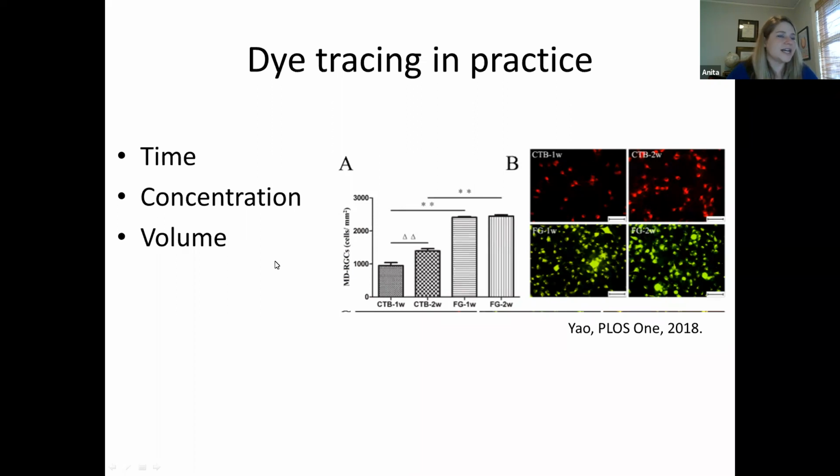And because they're dyes, the one other thing I will say is that when you're using, for example, a glass pipette to inject these dyes, you have to be really sure that you don't have precipitation of your dye at the tip of the needle. So you really have to make sure it's clean. If you're doing multiple injections, you probably need to clean the pipette tip or potentially just cut it a little bit so that the precipitate's not sitting there. There was one other thing, but I forgot what it was.